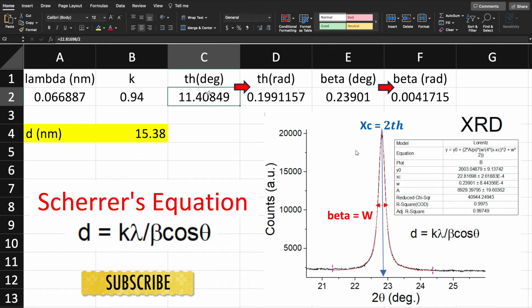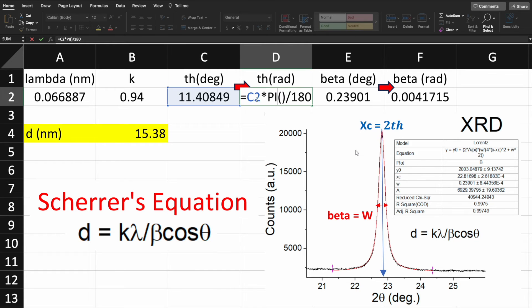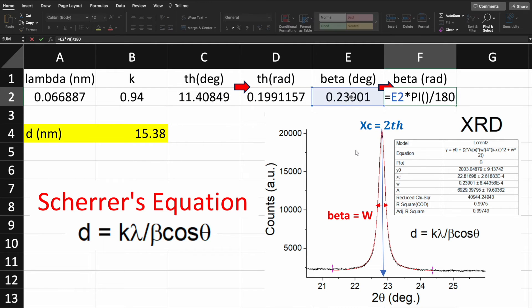First thing we need to do is convert into radians. Multiply this number, that is 2 theta, with pi divided by 180. Similarly for beta, which is again in degrees, multiply this number with pi divided by 180. This way we get theta and beta values in radians.